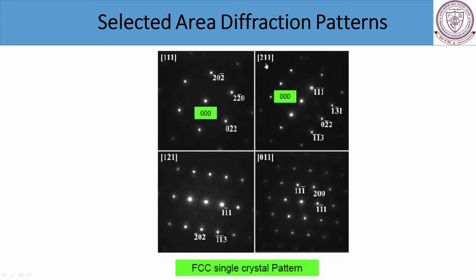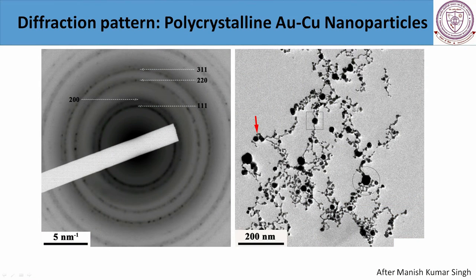In this bracket, this is known as the zone axis. By zone axis, we mean the beam direction eventually, but it has to be explained a little bit, which is not part of this module. In the next slide, this is work from one of our doctoral students.